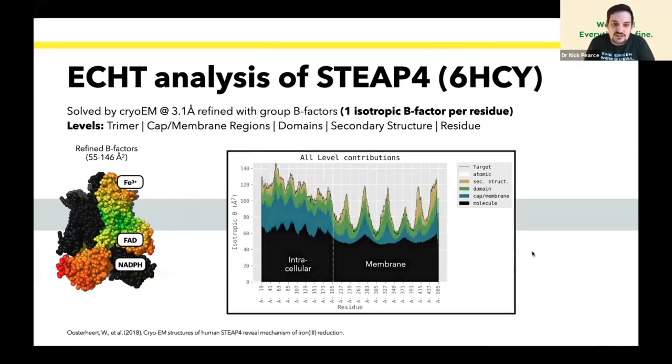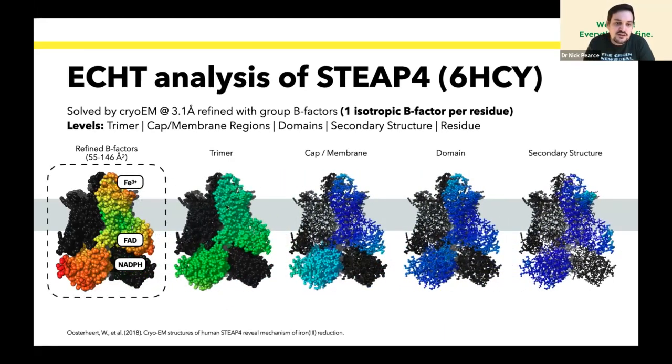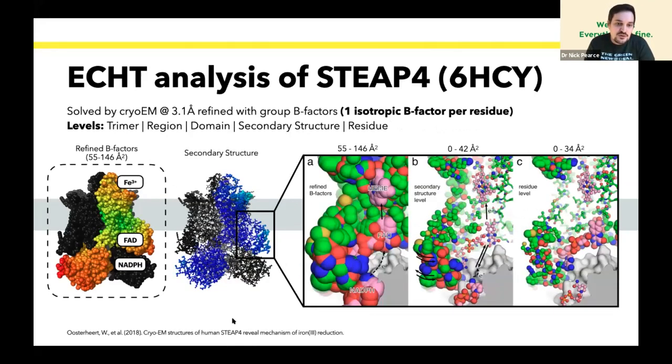So you can break down the disorder at different levels and see where the disorder in this structure settles. We can split up the disorder in the refined structure. There's a large component in the trimer, and when we split it into the membrane and the cap section, the cap is at least compatible with some form of group motion. It is certainly more disordered than the membrane component. Then you can split down separately to find one for each membrane and intracellular component of each chain of the trimer. You can go even further and use a secondary structure annotation algorithm to define secondary structure groups.